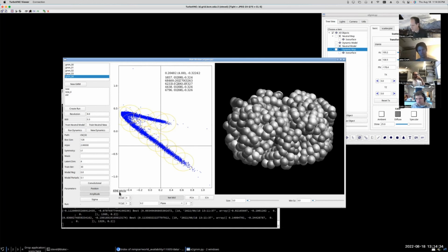But if you have a 100,000 or a 500,000 particle data set, and you're computing a reconstruction from 15,000 particles for each of these yellow circles, then you're going to have this space that you're trying to characterize, and you're going to have to wait 24 hours, or an hour or 2 hours or something, to see the results while it does all of the 3D reconstructions. So the abstraction gives us an additional tool to see, well, what should I expect to see in the maps? And then you can do the reconstructions, and if you actually see what the Gaussian model caused you to expect to see, then everything is reaffirming each other, and you can be confident of your results.